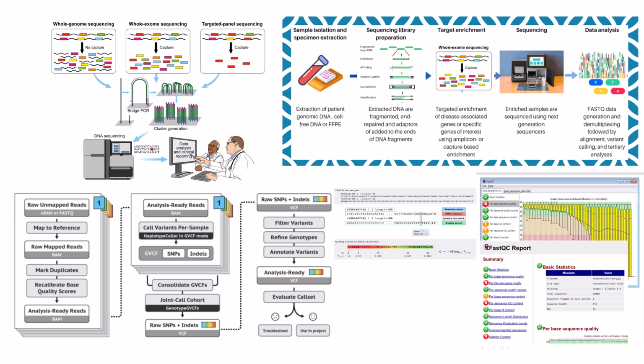Smart. Yes. And then there's another refinement called base quality recalibration, often using GATK tools. This is pretty sophisticated. Okay. See, every time the sequencer calls a base, an A, T, C or G, it assigns a quality score, like a confidence level. But these scores aren't perfect. They can have known systematic biases based on things like the machine cycle or the sequence context around the base. Right. So this recalibration step uses known patterns of sequencing errors and also databases of common known variations to adjust those initial quality scores for each base. It makes them more accurate.